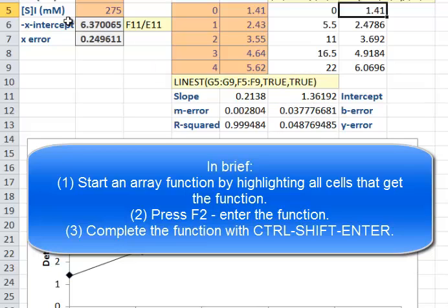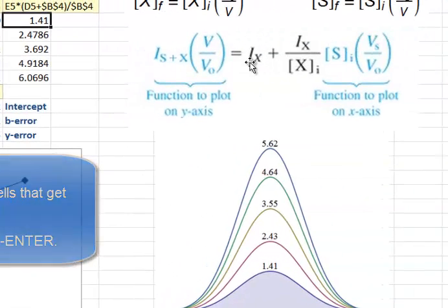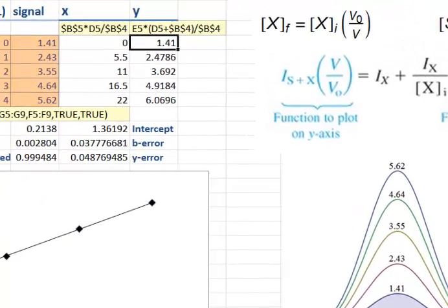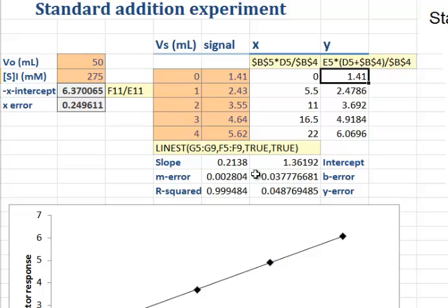We use this information to figure out the answer to our question: what's the concentration of our unknown? Remember that our unknown is related to the slope and the intercept. The slope and the intercept are kept, in my case, in cells F11 and E11. So I divide those two and I get a concentration of the unknown of 6.3 millimolar. That number seems fairly reasonable. We notice here that by almost doubling the concentration with the first stock solution aliquot, I almost double the detector response. So the number is making sense.